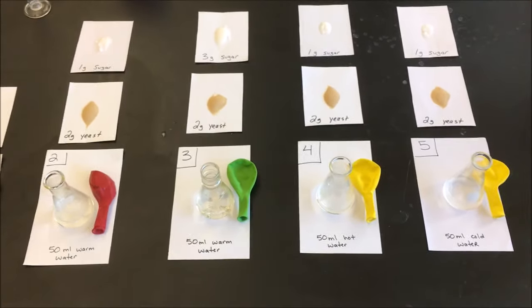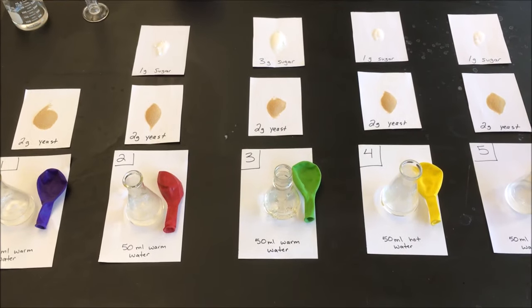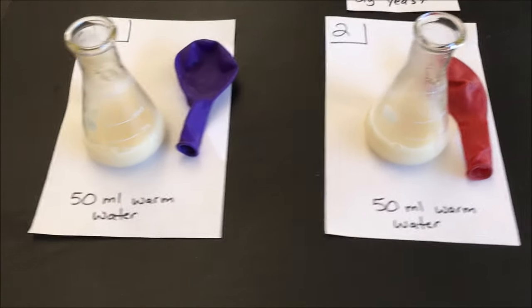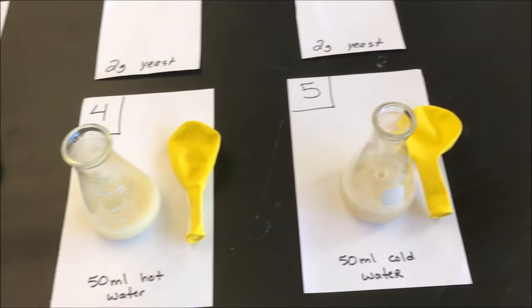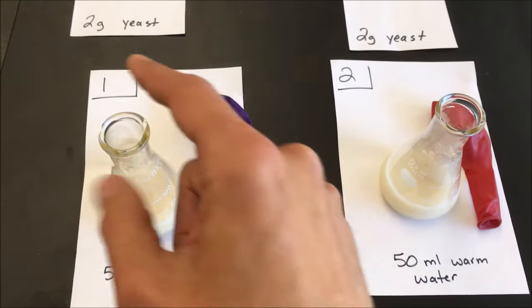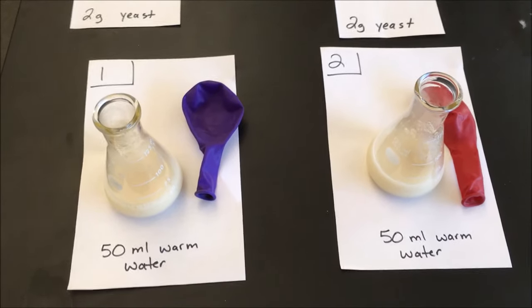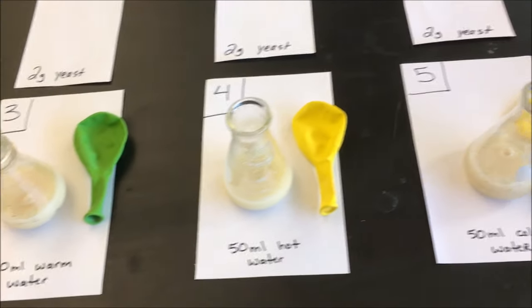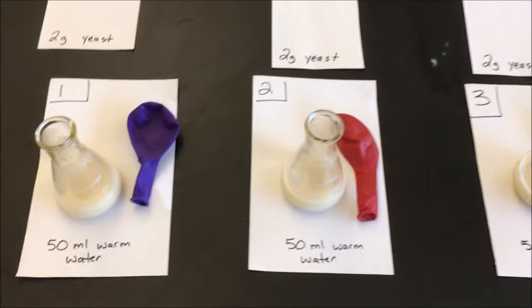I'm going to set the camera down and go ahead and mix all of these, and I'll be right back. Okay, now that I've mixed all of those together, notice that there's a balloon next to each flask. In a moment I'm going to attach the balloon to the top of each flask so the balloon will capture any gases given off by the yeast. I'm going to stop filming and come back to show you what I've done.